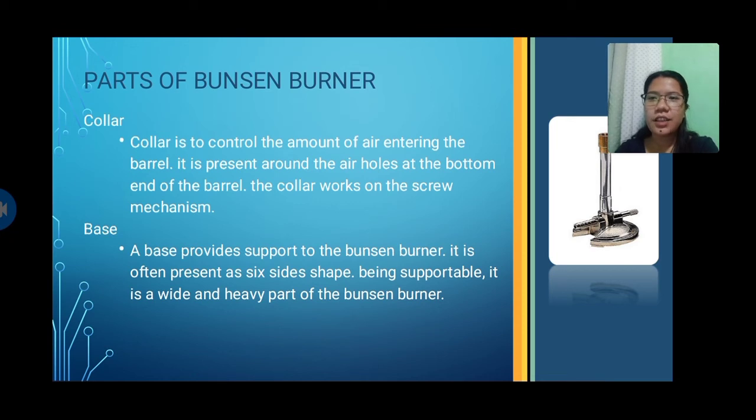Collar. It controls the amount of air entering the barrel. It is present around the air holes at the bottom end of the barrel, and the collar works on the screw mechanism. Next is base.